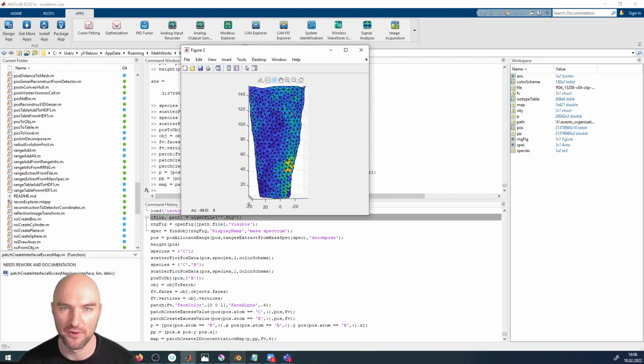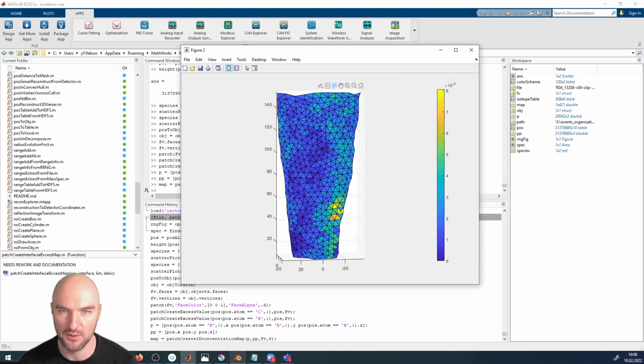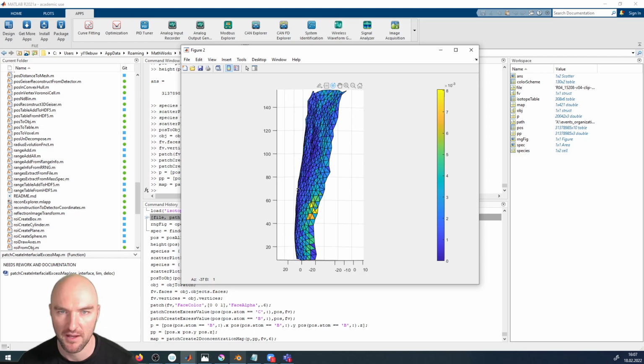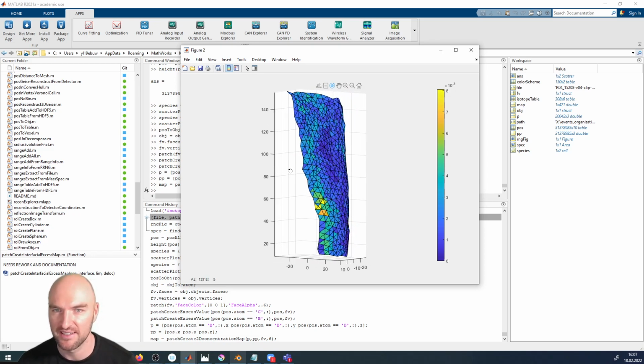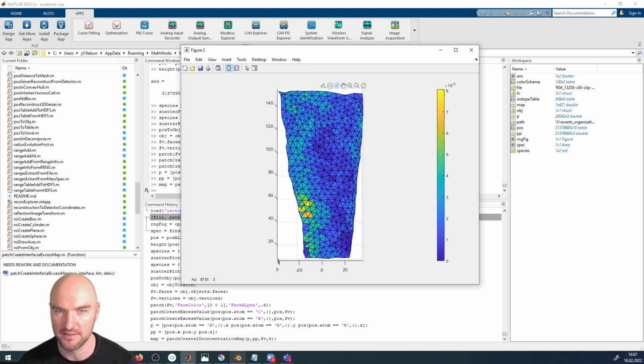Yeah, and here we already see, okay, we have local differences in the concentration. And it might look like it's not a big difference, but we have concentrations of close to 0 versus concentrations that are 0.8%. Say 10 to the minus 3 is 0.1%. And yeah, so you can see this is already a centroidal Voronoi tessellation, best optimized interface, for a nice curved interface.